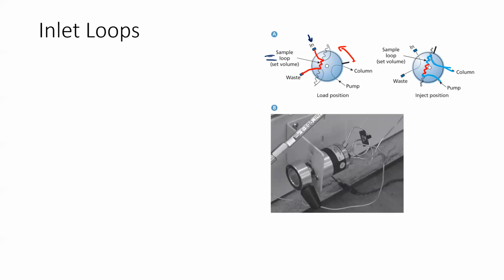And then the air that you're blowing at your little brother is your mobile phase, right? And so it pushes that sample through the straw, but you get a set amount of sample each time because your Jello cube is only 1.25 inches thick or whatever. Sometimes I understand my analogies are not the best, but I try.